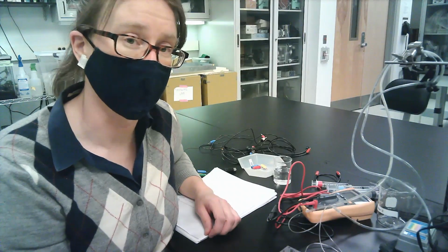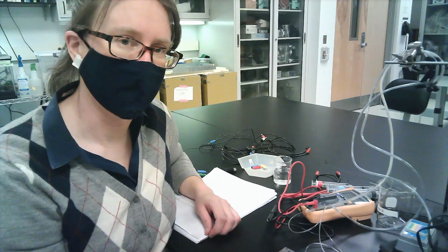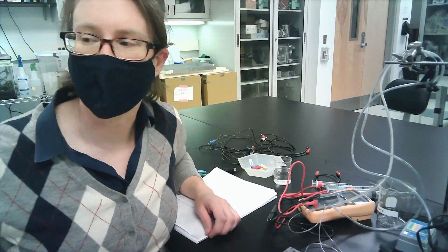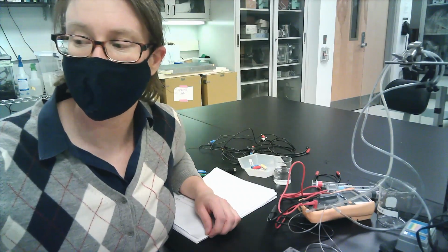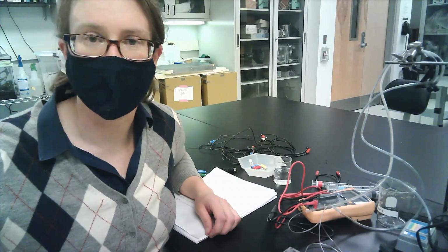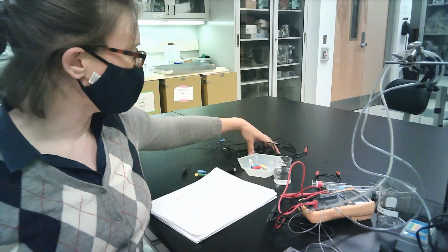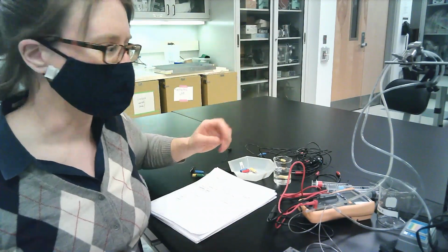Okay, so then what we're going to do next is we're going to set up a set of two circuits, a stimulating circuit and a recording circuit. So there's a wiring diagram for all of this on Canvas. I recommend having a copy of the wiring diagram handy because when you get to your table, you're just going to see a whole mess of wires, and you're going to be going, okay, well, what goes where?